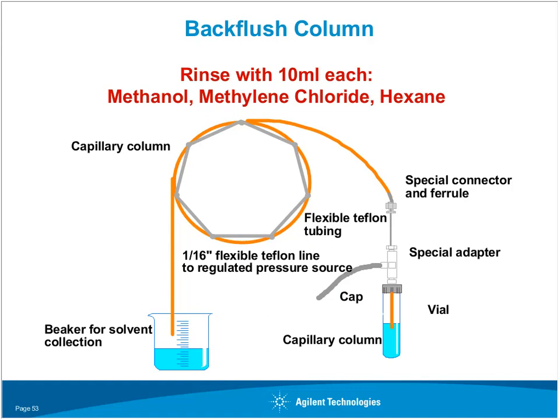The other thing I'd like to add, I've done this for quite a while, is that I'm not going to tell you to stop doing things that work for you. My philosophy is, if it's not broken, don't fix it. But please, just think about what I said. If you're doing these large volume injections of solvent, remember, you're washing all those contaminants through the column. So it's better to trim the column or rinse the column by backflush.